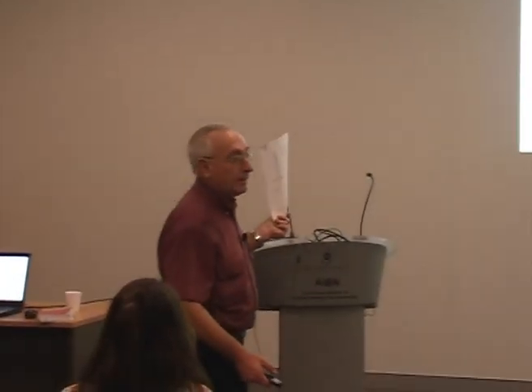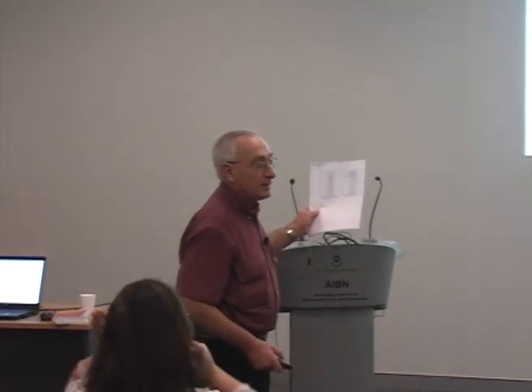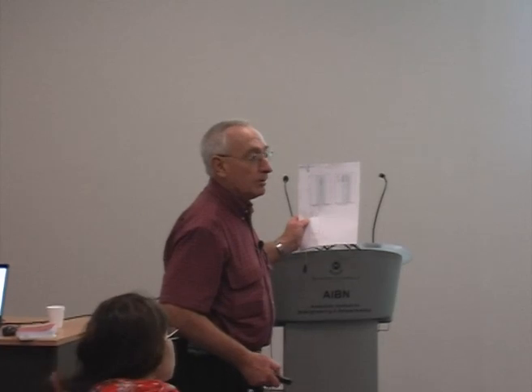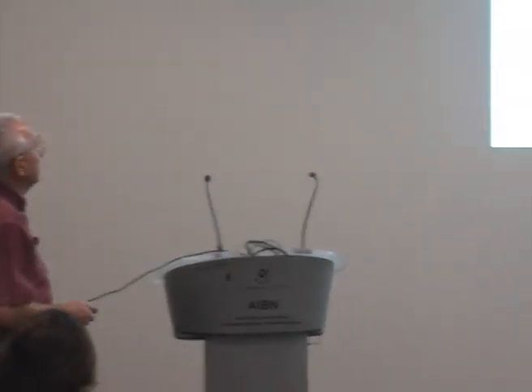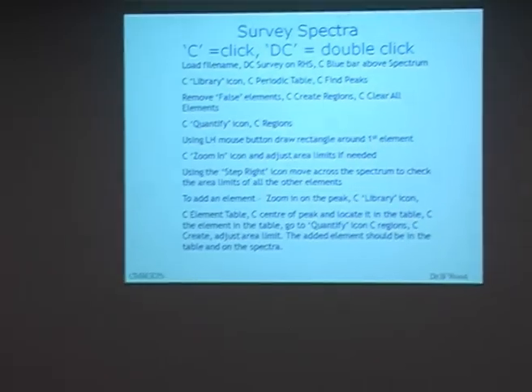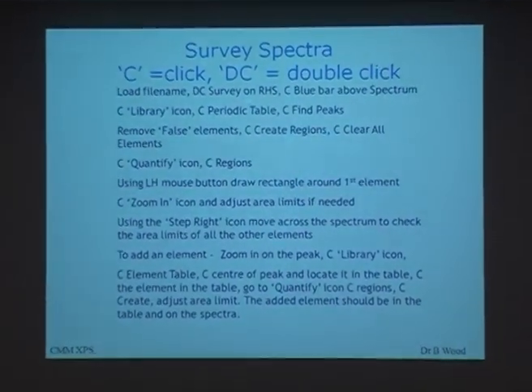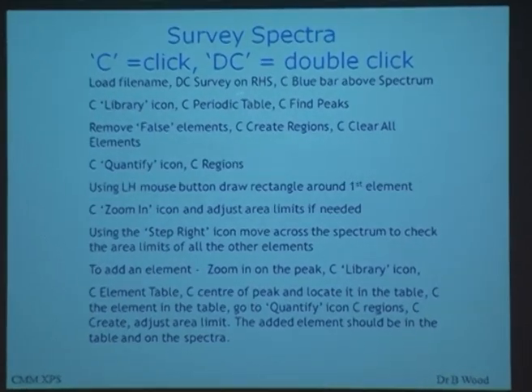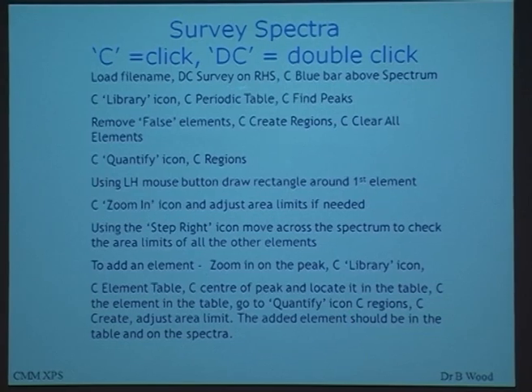I've given you a handout of PCL from the high resolution XPS of polymers book. We're going to process that. It's a fairly simple exercise, but you learn a lot on just what to do with curve fitting. Curve fitting's the difficult part. And I've put together something like this. I gave up after a while. You double click and single click. It's easy, so just watch what I do here, take your own notes, maybe come back to this later on.